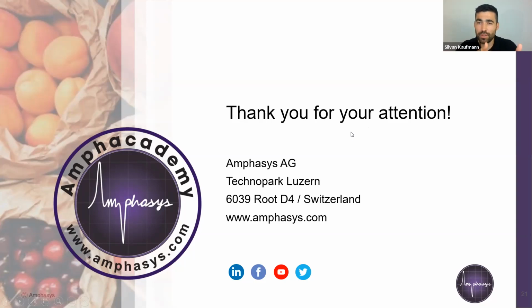Then we also had this other pollen trap design with the paper funnels, and there came a question what kind of paper we used for these funnels. We just used ordinary printing paper that you use for your printer. You can basically just wrap it around, make a funnel out of that, glue it together so that it's holding, and then you're ready to go. It was not a specific paper.